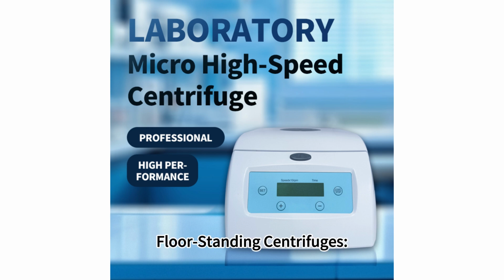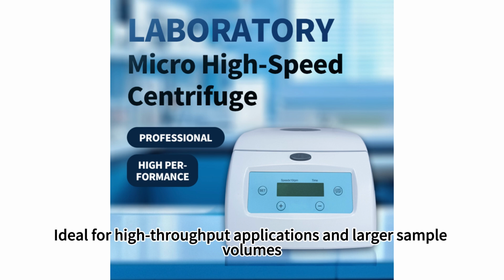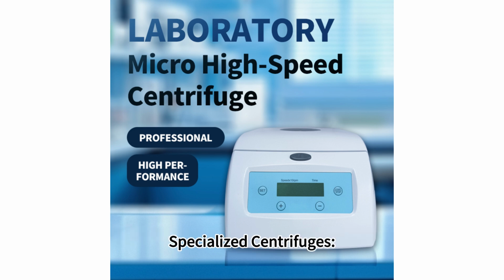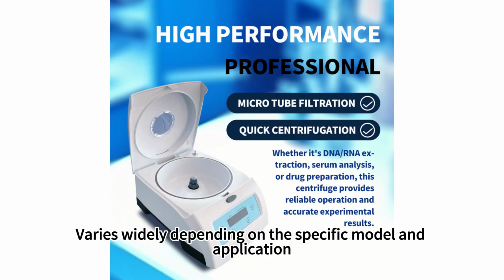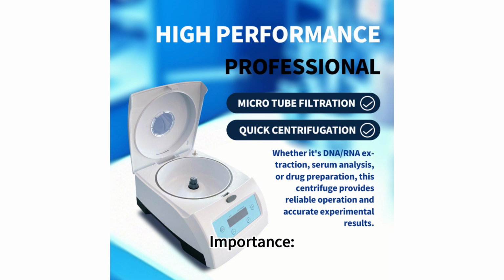Floor standing centrifuges: volume can accommodate larger volumes, up to several liters. Importance: ideal for high-throughput applications and larger sample volumes. Specialized centrifuges: volume varies widely depending on the specific model and application. Importance: designed for specialized tasks such as ultracentrifugation.